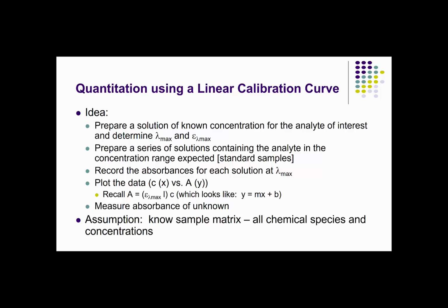And so what we need to do is to generate a curve, a calibration curve, that shows to us and to others that over the concentration range of interest, we can indeed anticipate that there's a linear relationship between analyte concentration and absorbance. And so we're going to use a statistical technique known as linear regression because we're going to work with real samples. The standard samples are going to show real absorbance values. They're not perfectly going to fall along any linear line.